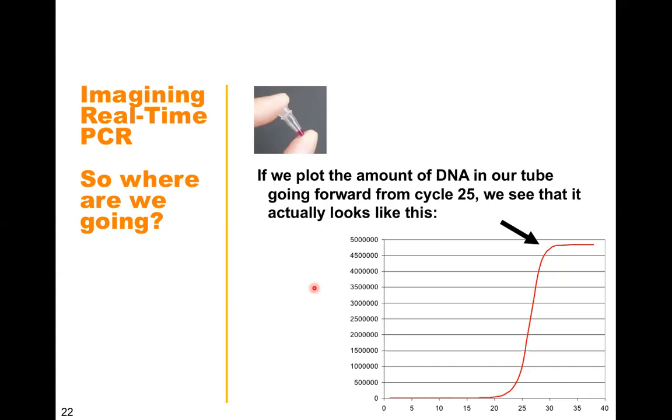So now what can we say from 28 to 25 to 23, how much of a difference in terms of expression is there? After every cycle, the molecules get amplified, or doubled. So the difference between 28 and 25 is 3 cycles.